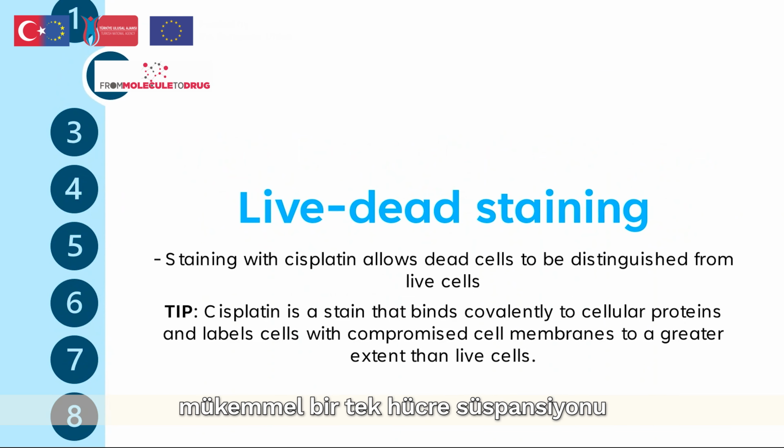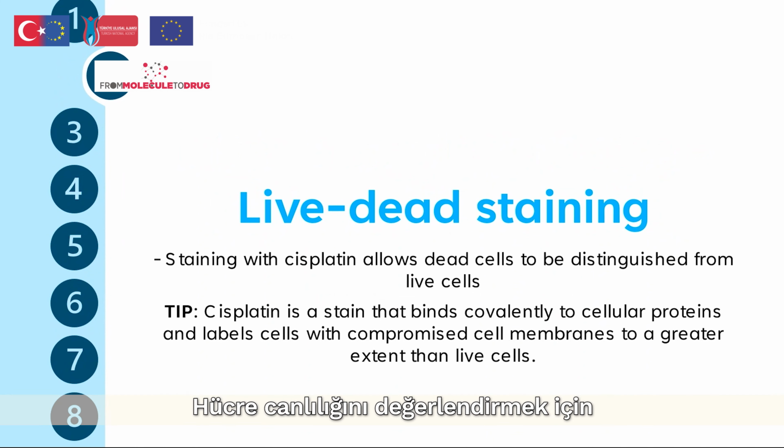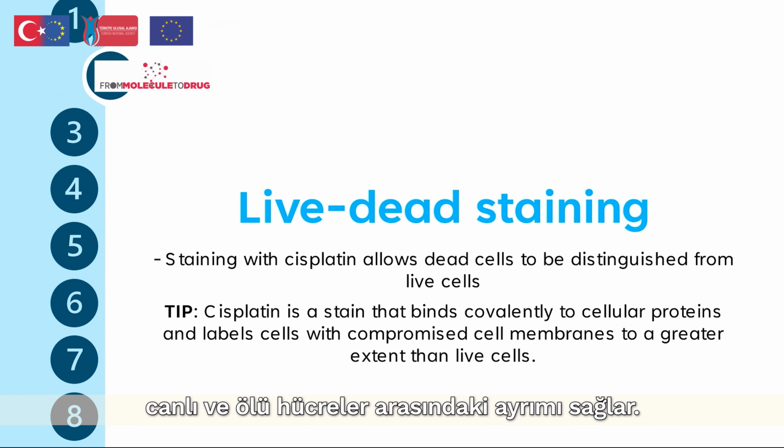Achieving an excellent single-cell suspension is crucial as it preserves cell viability and prevents clumping. An initial staining step with cisplatin is employed to evaluate cell viability, enabling the distinction between live and dead cells in the subsequent analysis.